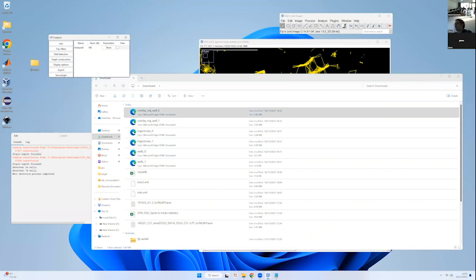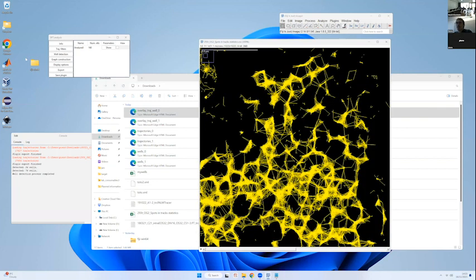If you want David to show the graph now. Okay, so 3 minutes of theory, and then we go back to the practice. So now let's go to this well reconstruction.